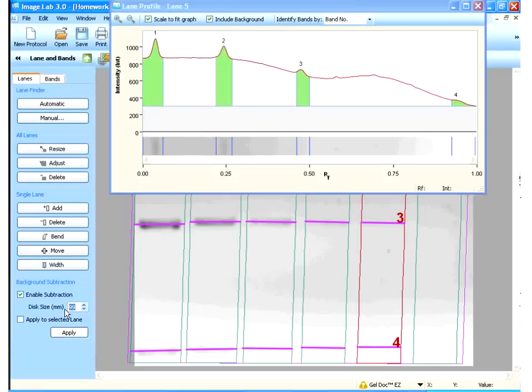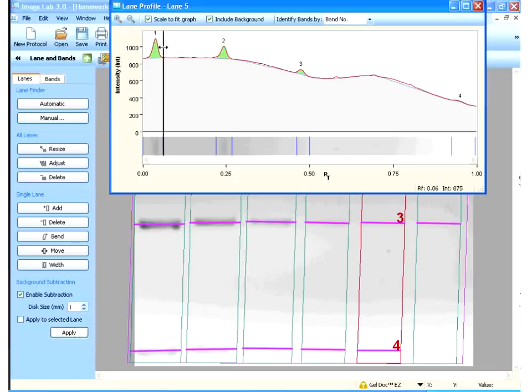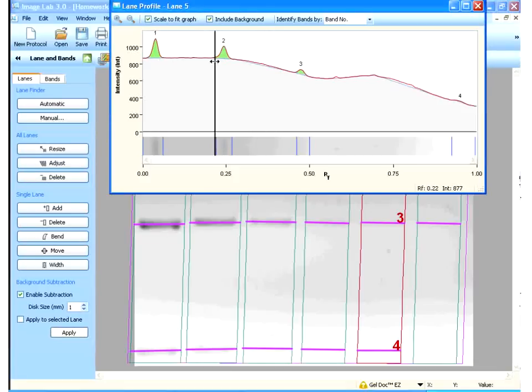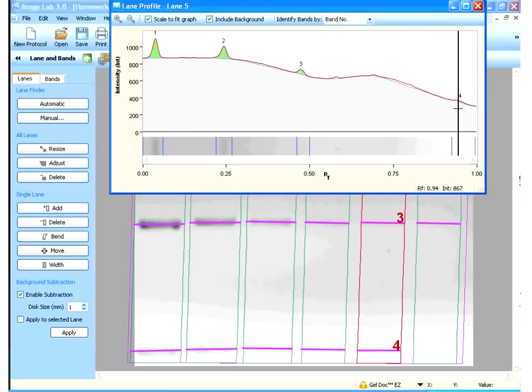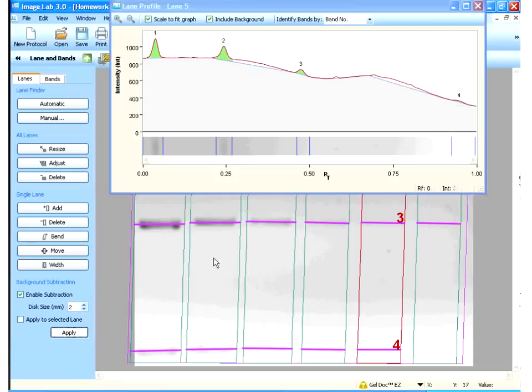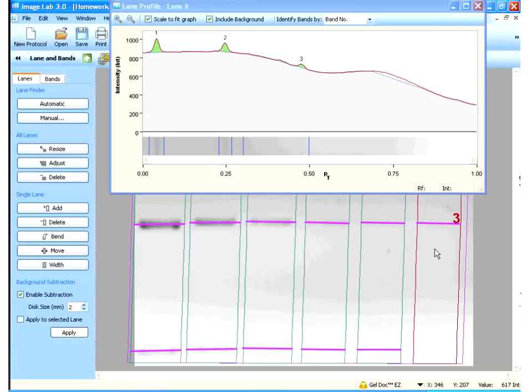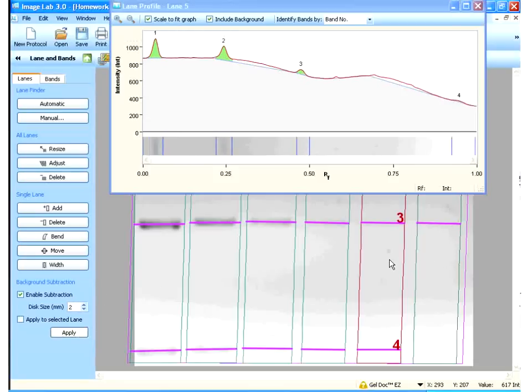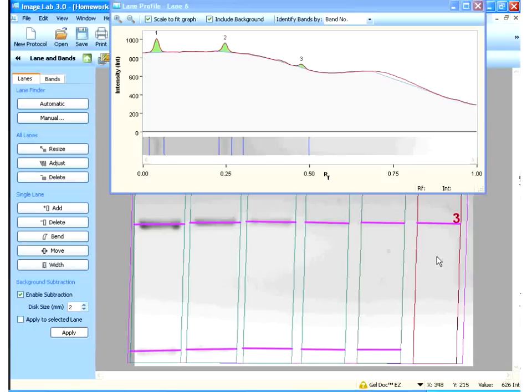So, let's try setting this now to one. Now, look at how close now. The background follows the peaks. So, I'm cutting just the peaks there. If I set it to, say, two, get a little bit more here. I'm looking at this part here. And, that's pretty good. So, that's this last lane. Sorry, this lane here. Let's look at the last lane here. Not bad. As far as this one goes. Although, I'm not happy that it's taking this density here. So, I'm going to move this here to that one.